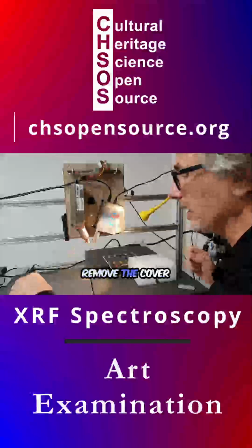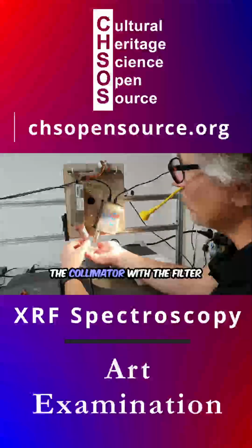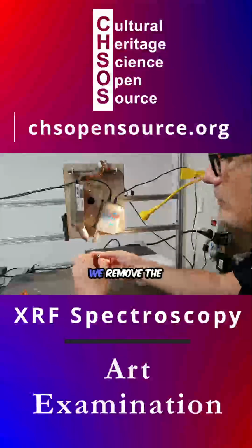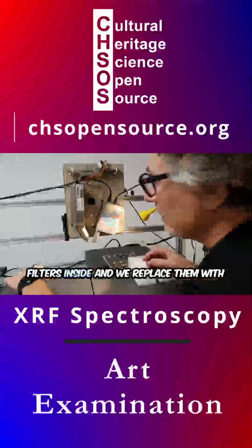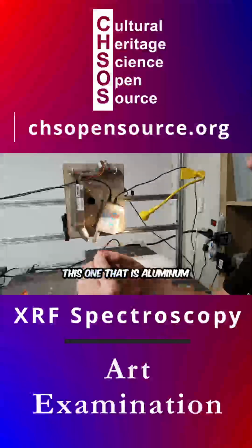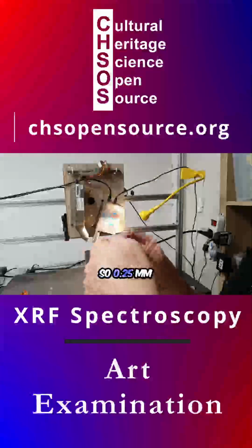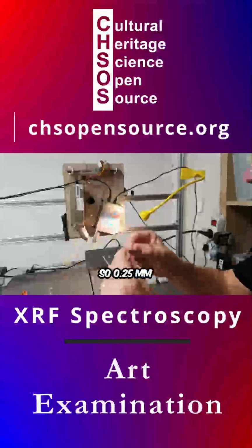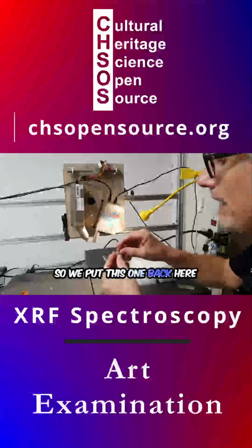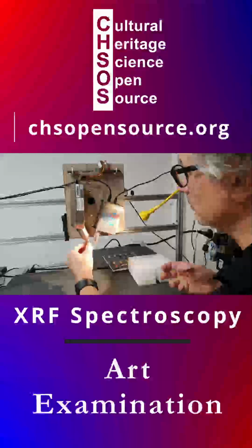Remove the cover, then we unplug the collimator with the filter. We remove the filter inside and replace it with this one, aluminum 1/4 of a millimeter, so 0.25 millimeter. We put this back in the collimator.